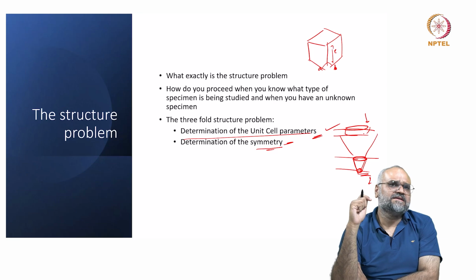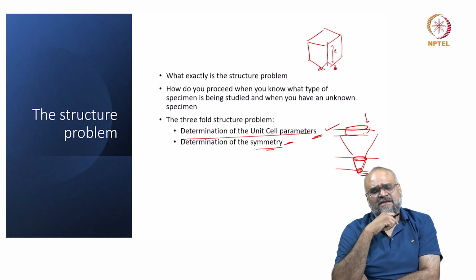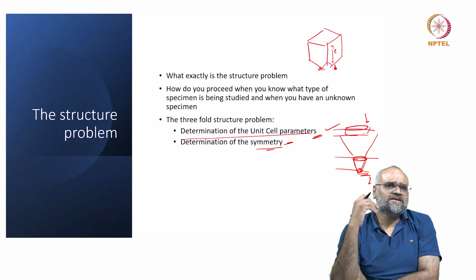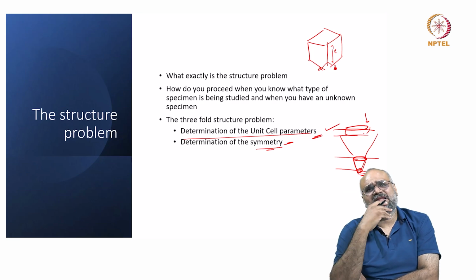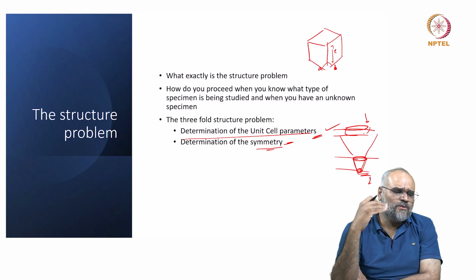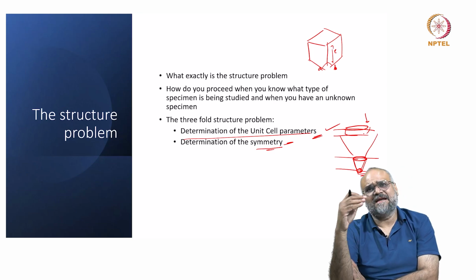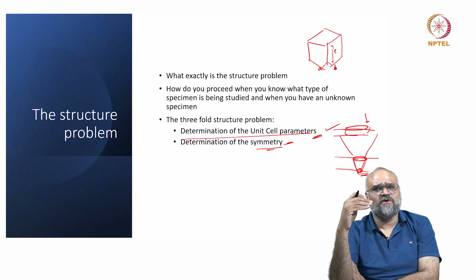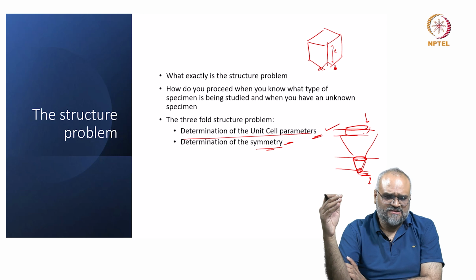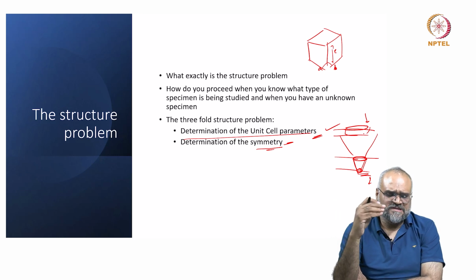But when I am doing this in the transmission electron microscope, because I can also see the projected images, if I have a microscope that can resolve the lattice fringes within a crystalline sample, I can actually see how my atomic planes are arranged. By changing the focus within the specimen, I can obtain what is called a through focus exit wave reconstruction, and I can get exactly where my atoms are sitting. Now, this idea of exit wave reconstruction and through focus, you will get to know in a little more detail when I talk about high resolution imaging in TEM, which will come at a later stage.